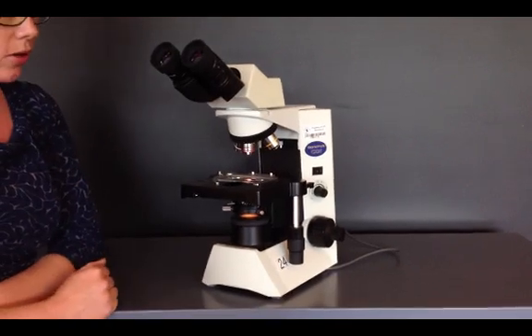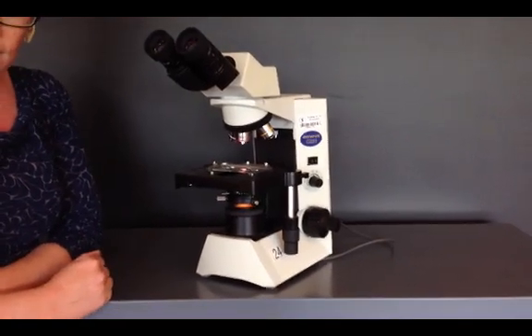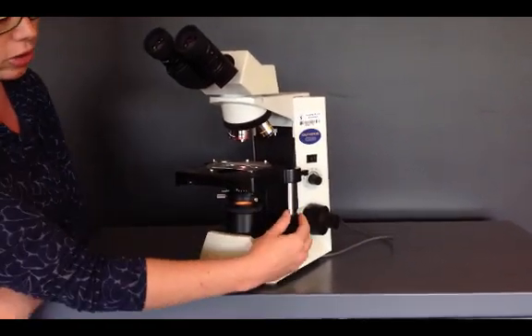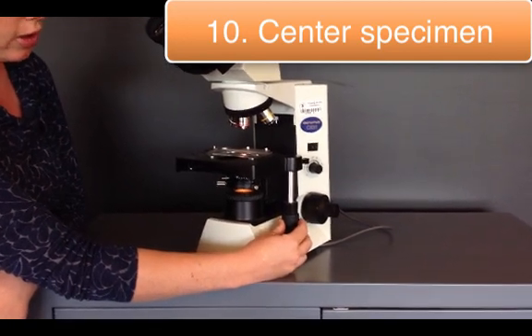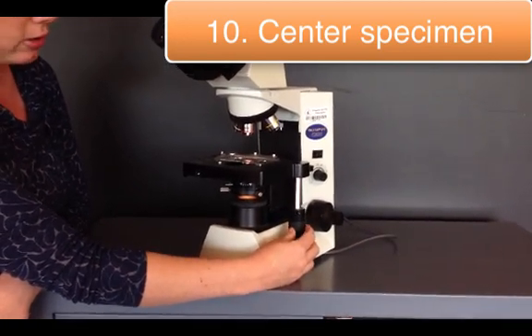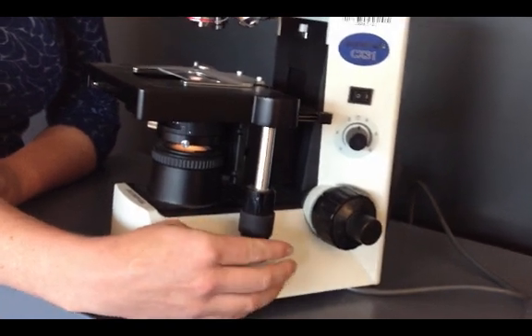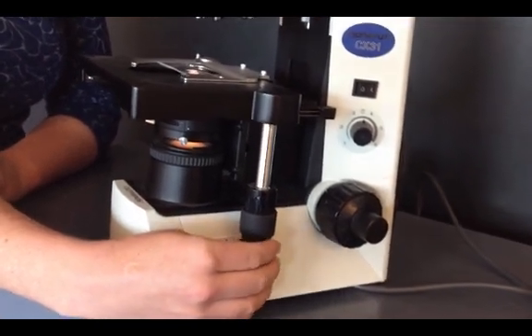Once you have your slide on, then you need to use the stage control to adjust the slide position so that the light is shining directly through your specimen. Center it as much as possible.